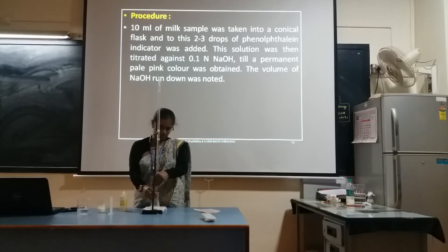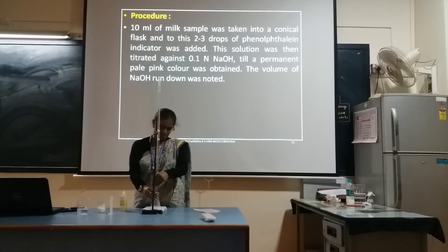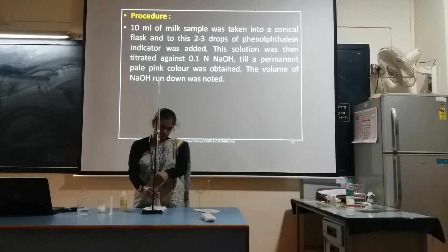Continue titrating until you get the permanent pale pink colour. Once you get the permanent pale pink colour, stop the titration and record the reading. Write that reading in the tabular column. While performing this experiment, continuously stir the conical flask for proper mixing of the NaOH with the milk.